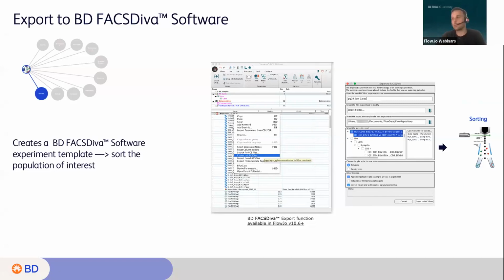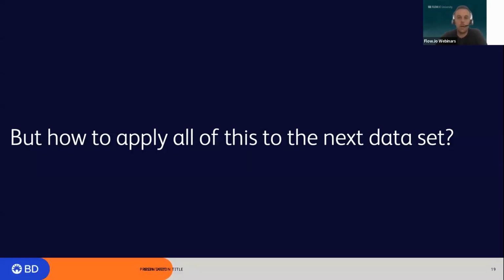So great, you found your cell population, you sorted it, and maybe hopefully you published your data, or it was just clinical samples. Now we are a few months from now, and someone comes with a new set of samples, and you have to analyze them to see if they match or are different compared to what you discovered earlier. Before, we had to restart from scratch.